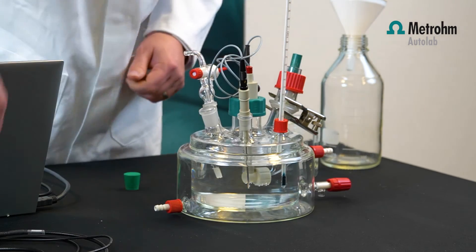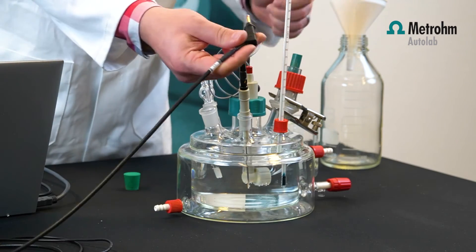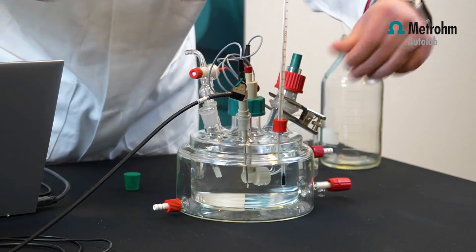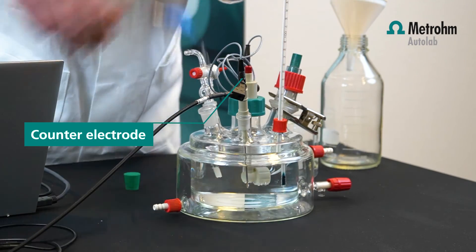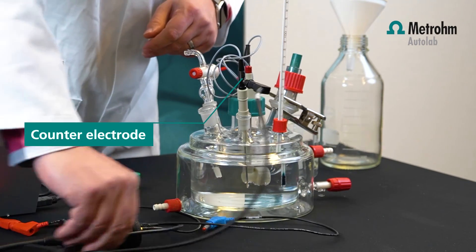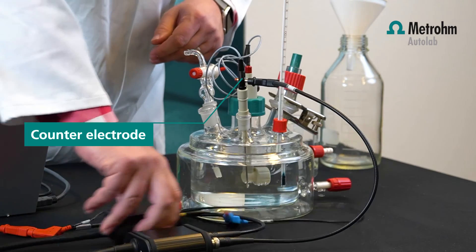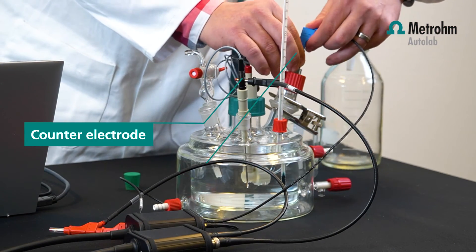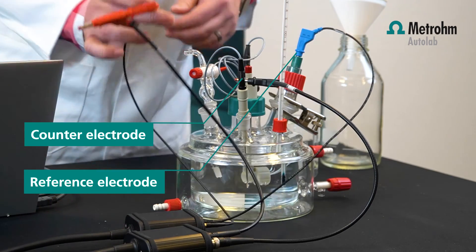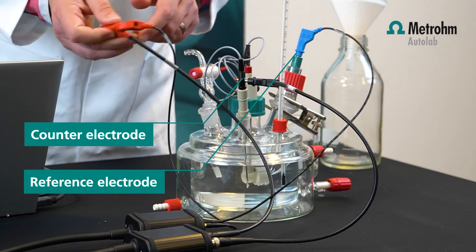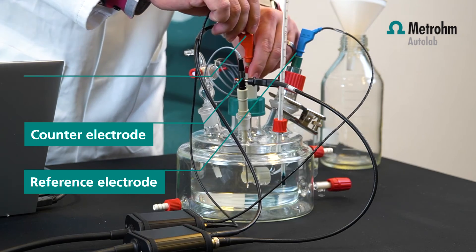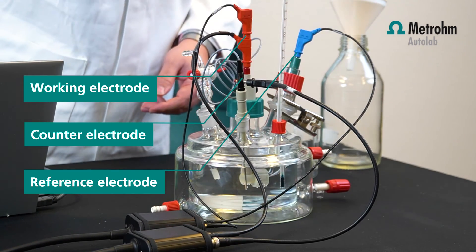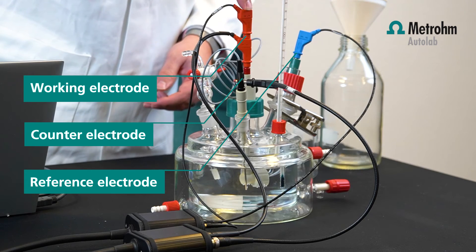Now the corrosion cell is filled. Put the reference electrode in the Luggin capillary. Now we connect the banana plugs, first to the counter electrode, then the reference electrode. Move the cables closer to the cell. The working electrode is in the middle. So you have your counter electrode, reference electrode, and the working electrode.